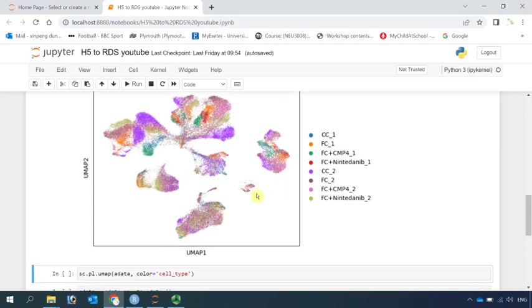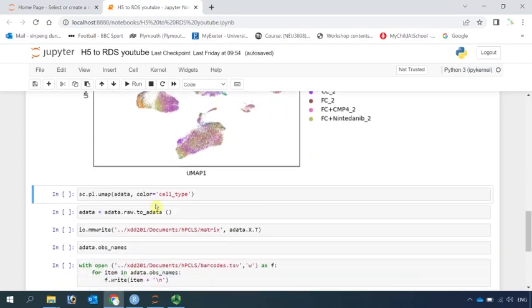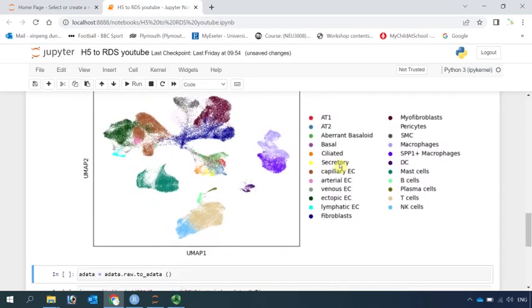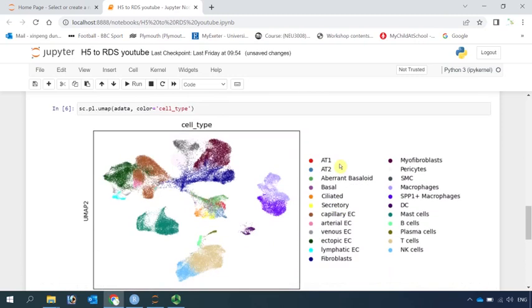We can also have a look at the cell types. Here are all the cell types labeled in the dataset.